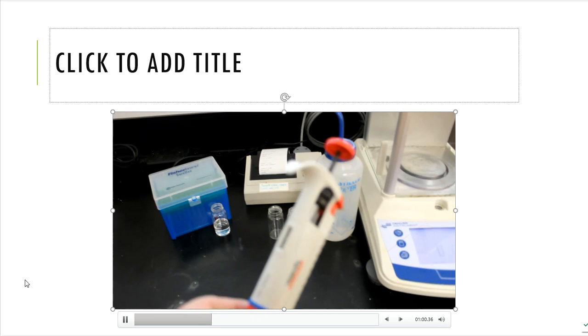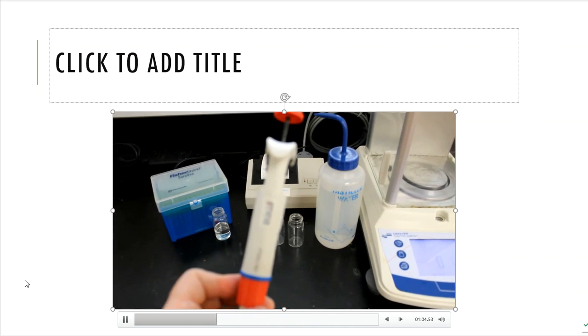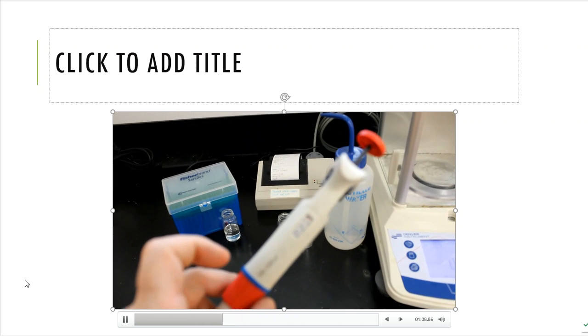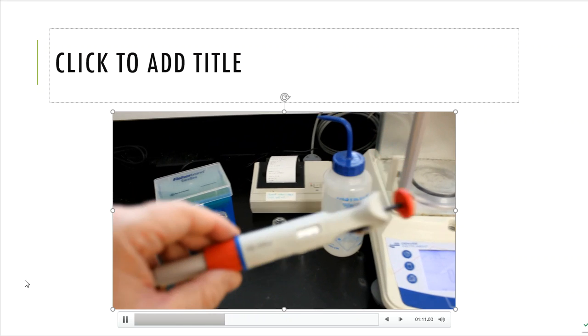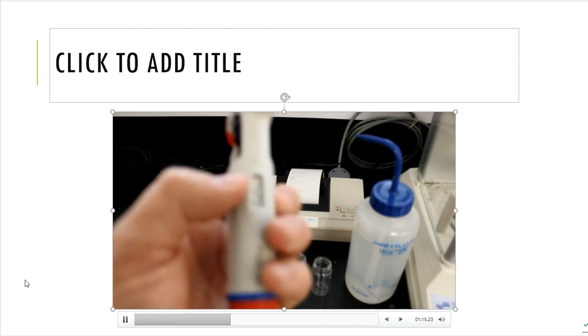The way that I use this is that up here at the very top, again, it's going to zoom out on you, but there is a meter. You can kind of see that meter right there. I'll take a picture of it that will have a better focus on it. And I'm going to take the pipette and dial in the appropriate volume amount.